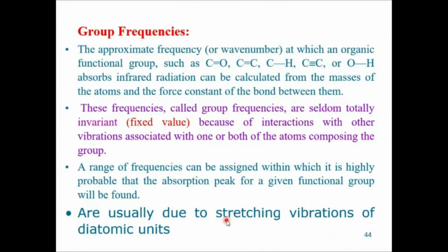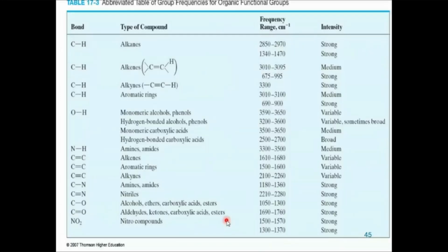Now let's look into the group frequency. Every functional group has typical frequencies associated with it. Go through the table: different functional groups, types of compounds, and the frequency associated with them, along with the intensity of the peak. We'll give you 2 minutes, go through this table. Okay, let's proceed.